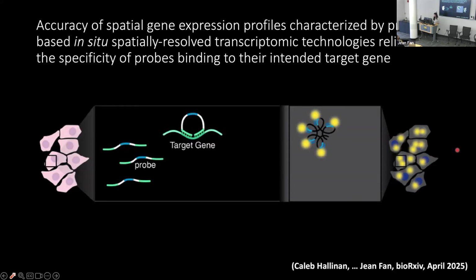Just as a brief explanation, the way Xenium works is that they use padlock probes. This is my doodle of a padlock probe. So these are their probes. And in theory, they can form these padlocks that have these arms that are complementary to a target RNA of interest. So then when ligation happens, you can get rolling circle amplification, and the rolling circle amplification has a sequence that has a readout probe that can hybridize.